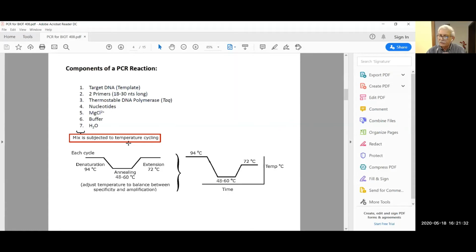But remember, you are going to high temperature, 94 degrees centigrade, which is very close to the boiling point of water. And high temperature causes a lot of movements of molecules within that PCR reaction. Even if you forget to mix it, that heat will mix all of it for you. So just mix a little in the beginning, just a little.